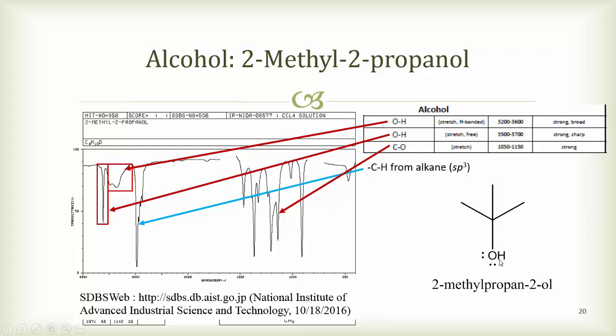So there are two alcohol stretches you may or may not see in different molecules. So this one, you do see the OH bond due to hydrogen bonding interactions with adjacent alcohols. And you also see an OH bond here, right around 3,600 to 3,700 wave numbers, which is usually very sharp and strong, which is due to the alcohol not hydrogen bonding to other adjacent alcohol functional groups.